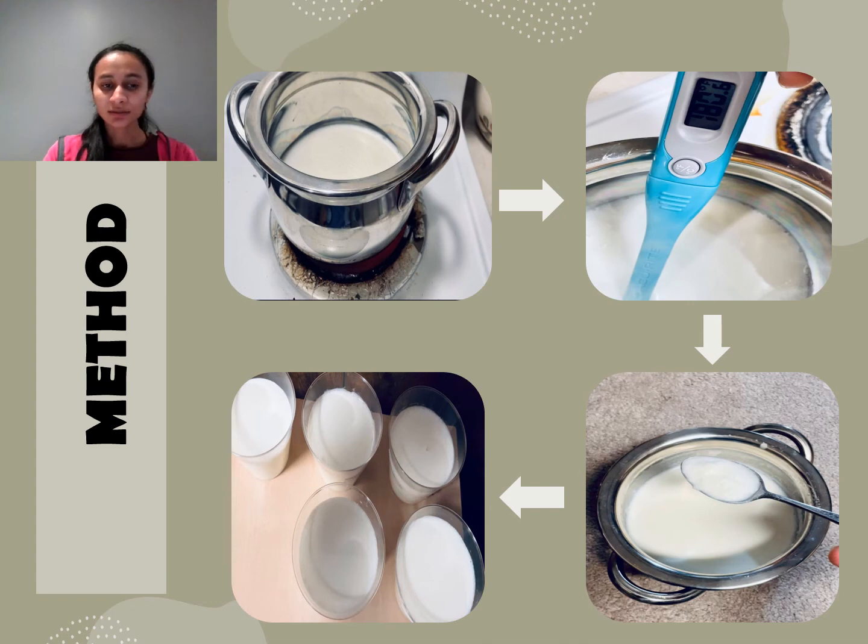Next is methodology. In this experiment, we used milk with different fat content. The fat content we used was 1%, 2%, 3.25%, 0%, and 10%, which is brand Sealtest.